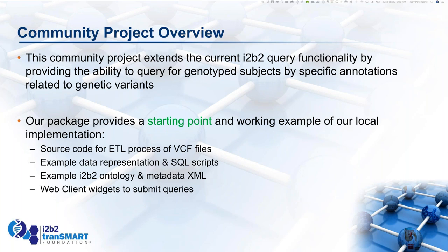And an example i2b2 ontology with the lab value metadata, which I'll briefly discuss, and essentially a web client new lab value handler that will allow you to capture this kind of genomic query in your i2b2 web client. So again, there are so many ways that one could implement this at your local site, but this is just an example of how we got it working at Partners.